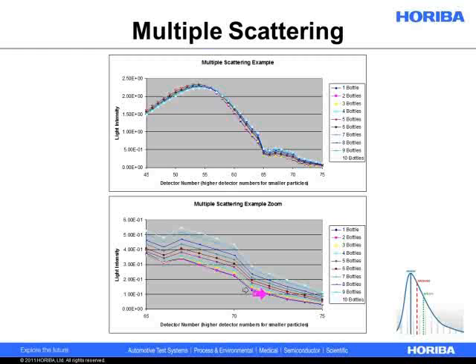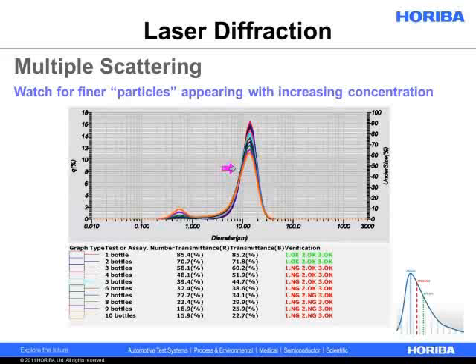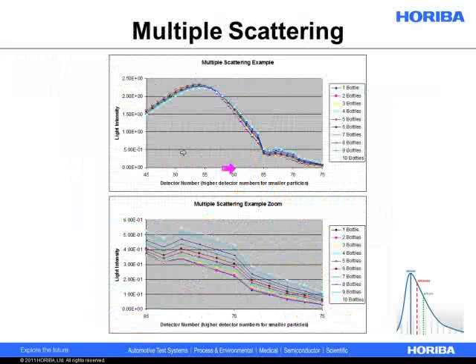You don't necessarily need to take it to this extreme, but a lot of cases aren't as clear-cut as this one is, in which case it could be useful to look at a tool in the 950 software called the intensity graph, and just see if the light scattering on your wide-angle detectors is monotonically increasing.